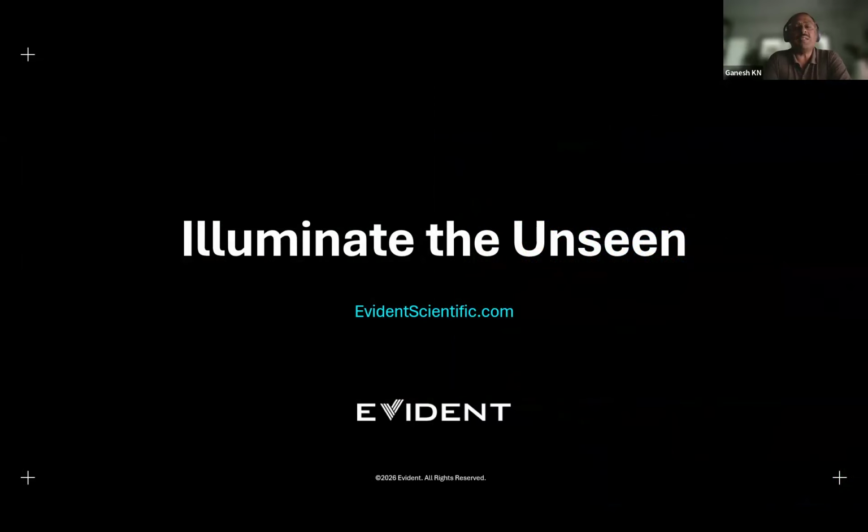speed, because this was one of the limitations of the conventional confocal microscope. Though confocal has given us an excellent resolution, excellent signal to noise ratio, and optical sectioning capability, there were some limitations. Some of these limitations were listed earlier. One of the major limitations is speed. Second was phototoxicity. Third was the sensitivity.